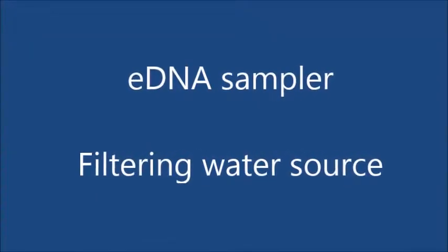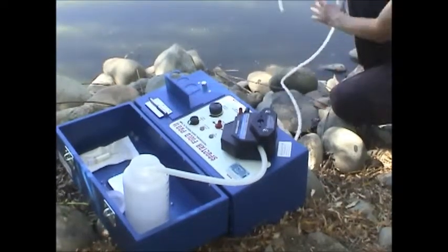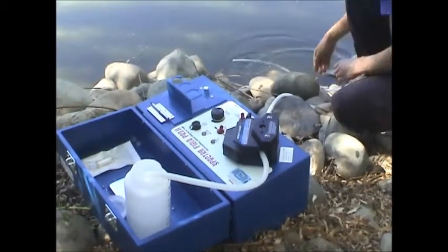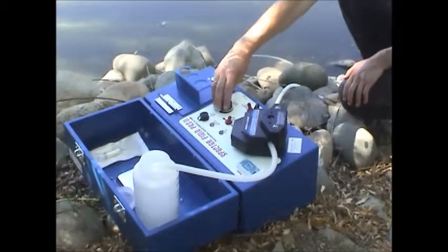Now we need our water source. EDNA is typically at the top of the surface, so we're going to do this the easy way and just float our line up on top. You might want to add some cheesecloth or something to keep big debris out.